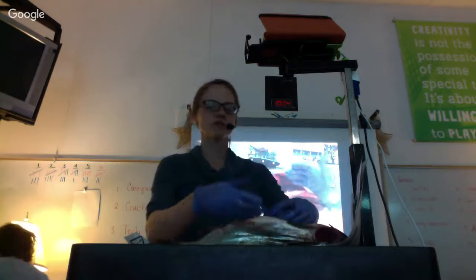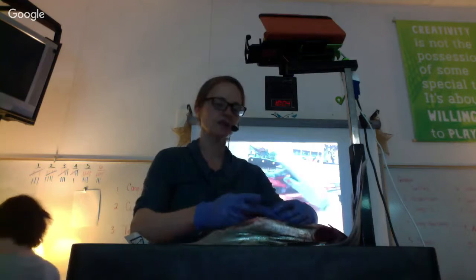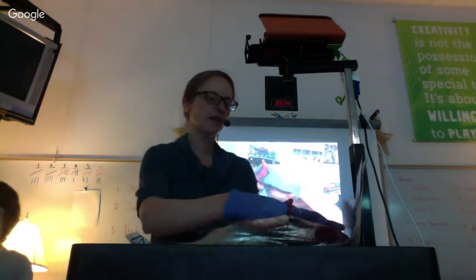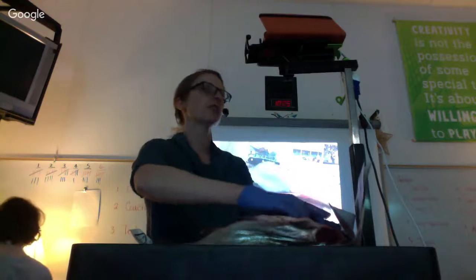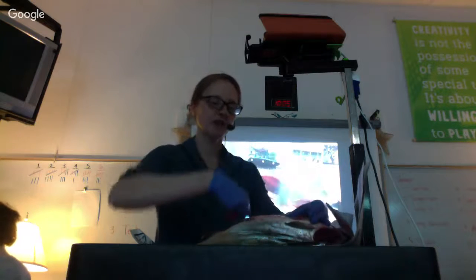Show one of the students in the class how to do this. You're going to just put your finger underneath the milt, and you're just going to pull very gently. You might have to tug it a little bit, but eventually it'll come off. And then adults, you might want to go do the top part, and you're going to pull out the milt, okay? And then the caregiver's going to put it up on the plate.